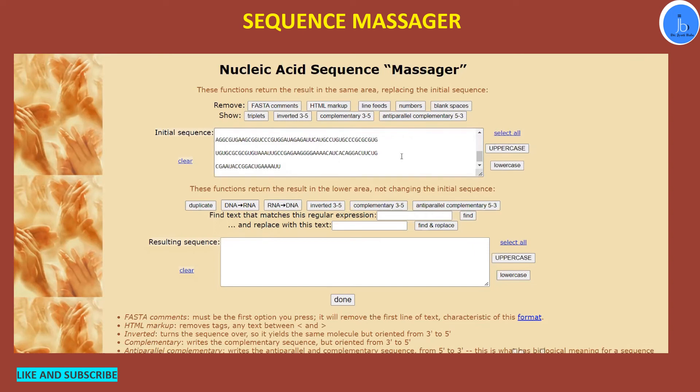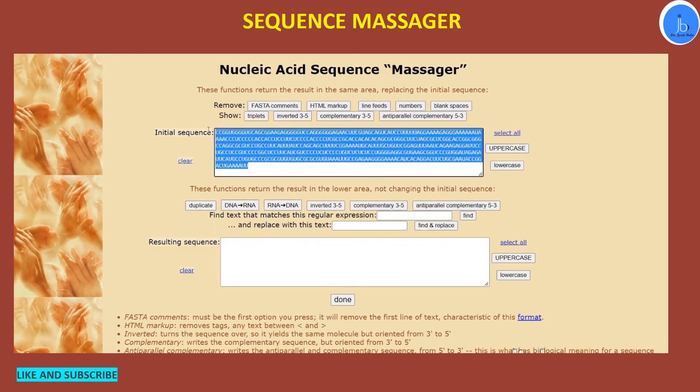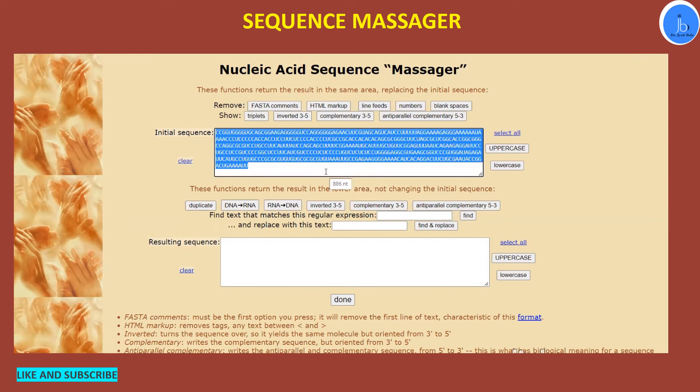So this also can be removed. So now you will get the plain sequences for your further analysis because these line breaks, these white blank spaces, we don't see them, but for computer bioinformatic analysis they will hamper the further analysis, so it's better to remove all these things.